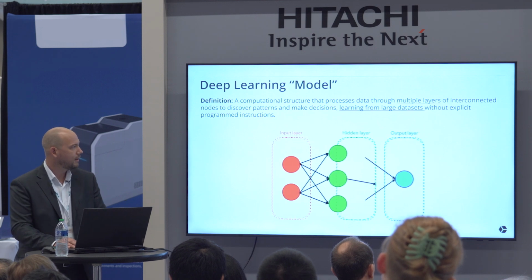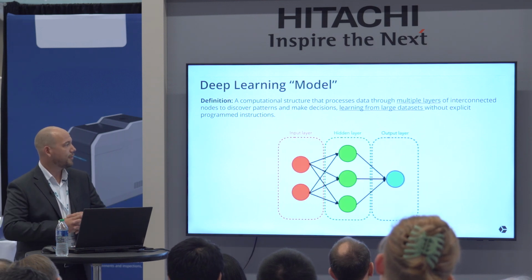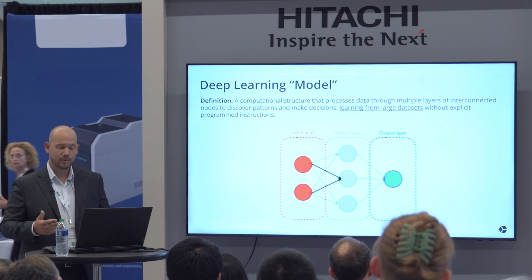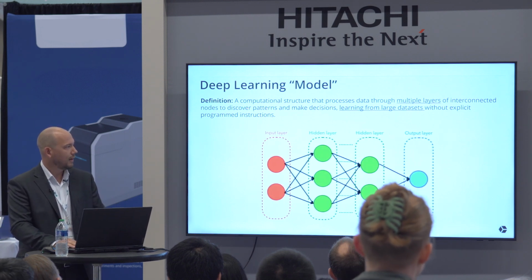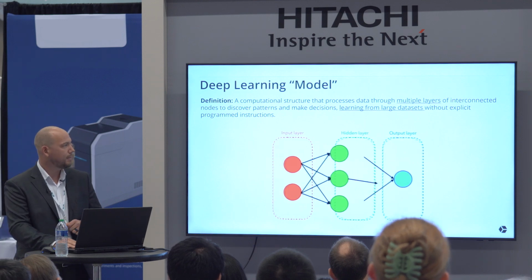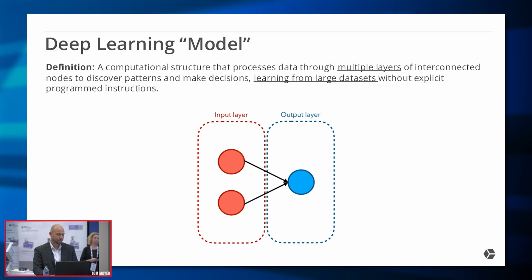This represents the different layers in the process. First, we have that input layer. We import our image with labels to let the model know what we're trying to identify. That goes through a process you can see with these hidden layers, and ultimately we have a model that's able to find complex structures, patterns, and areas.